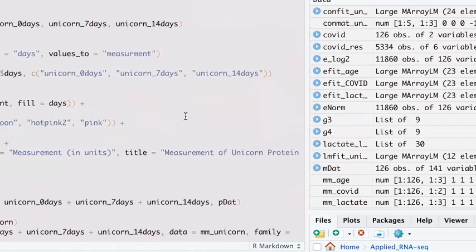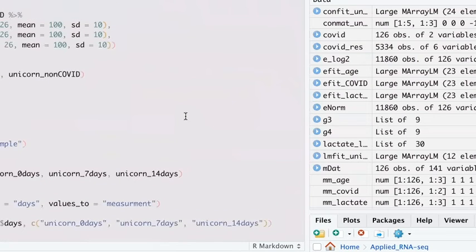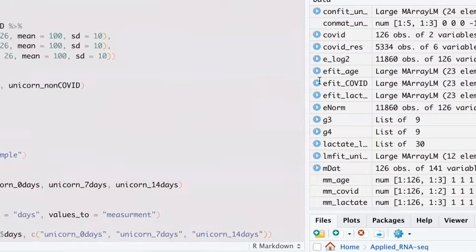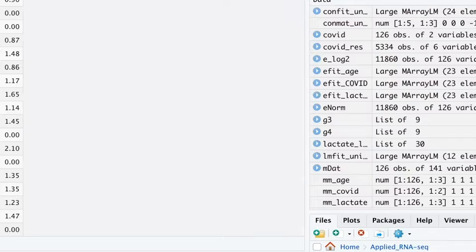So you can very explicitly say that it's COVID yes or no, but in the model matrix, if you saw, okay, let me find that over here. It automatically gave it as COVID yes. So it recoded the column by itself. Yeah, so the one is the base, and then the other one is the one we're comparing to.